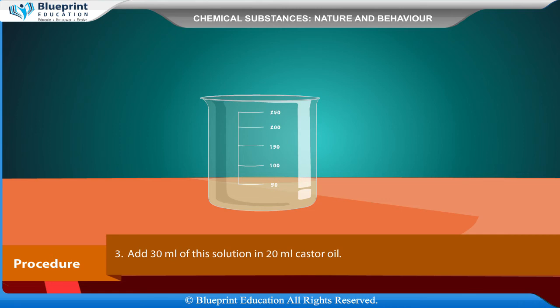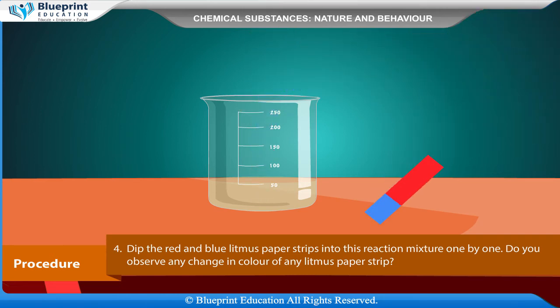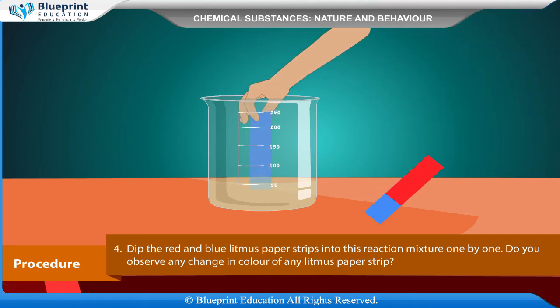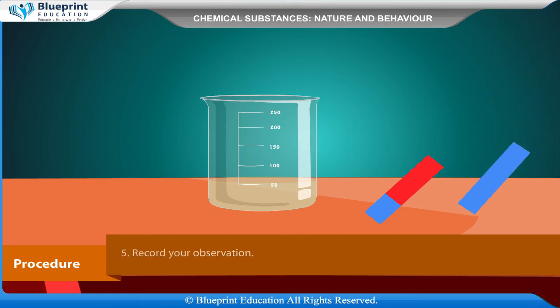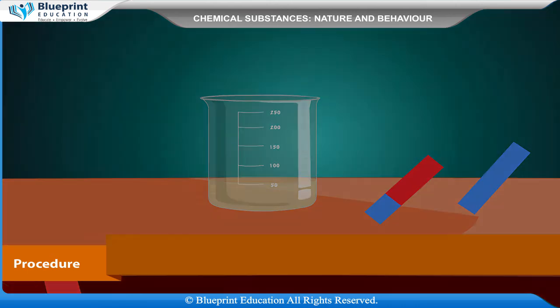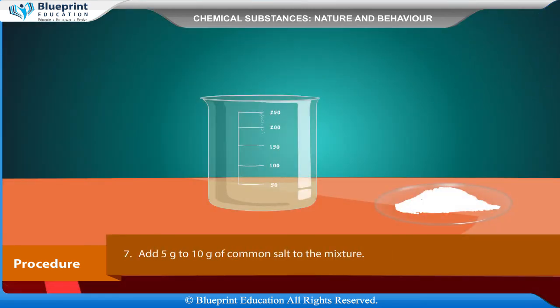Prepare about 50 ml of 20% solution of sodium hydroxide in distilled water. Add 30 ml of this solution to 20 ml of castor oil. Dip the red and blue litmus paper strips into the reaction mixture one by one. Observe any change in color. Record your observation. Now touch the beaker from outside — is it hot or cold?